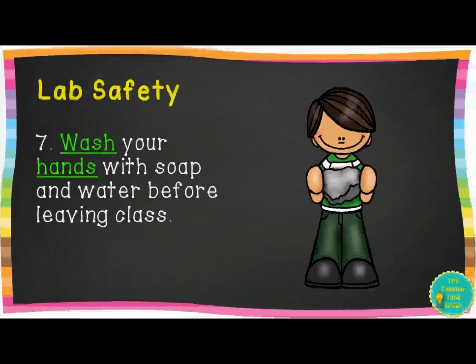Rule seven: wash your hands with soap and water before leaving class. Right after you finish the lab, let me know you're done, and I'll have you go into the hallway to wash your hands at the sink. That's just to keep everything clean, but in other labs it's even more important because you might have chemicals on your hands that could hurt someone.